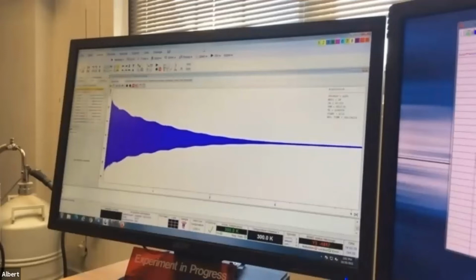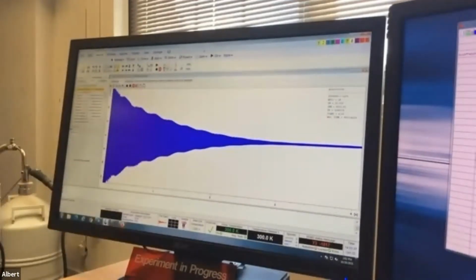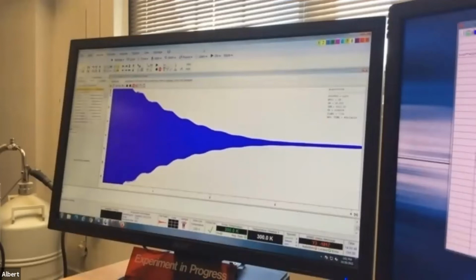That shows it right there. Yeah, so now we're on scan number 7 coming up. Right, and this right here is not readable. This is what you call a FID, a free induction decay. But we don't know any information about the spectrum from this. So we're going to have to convert this. After it's done, we'll convert it using a Fourier transform, but we don't have to do it. The processing software does it for us.